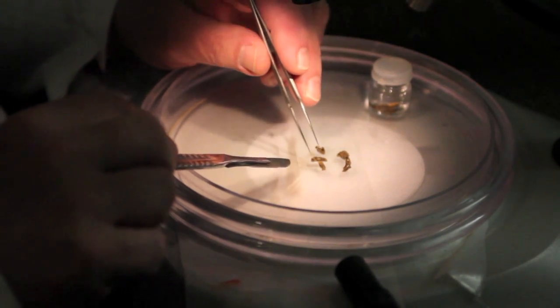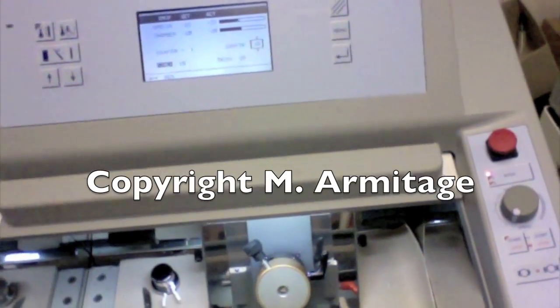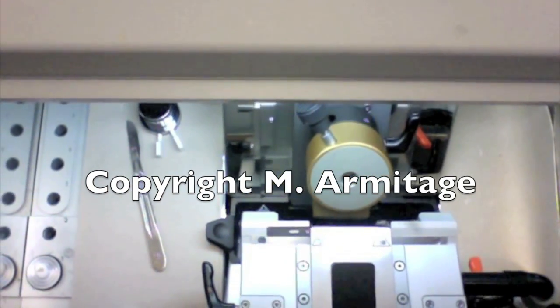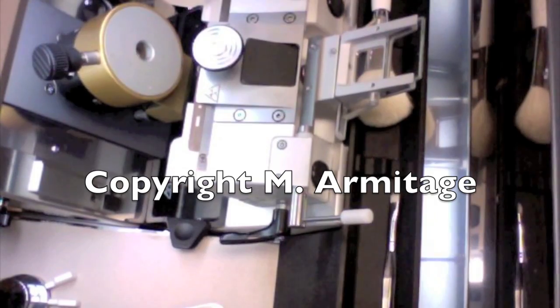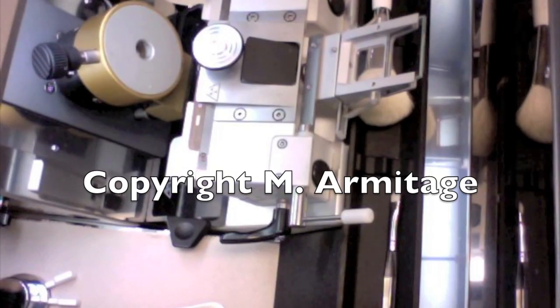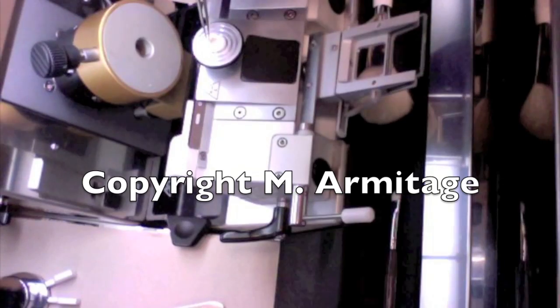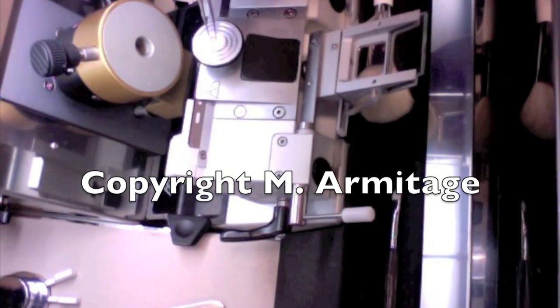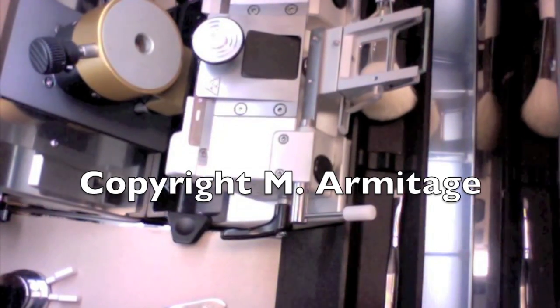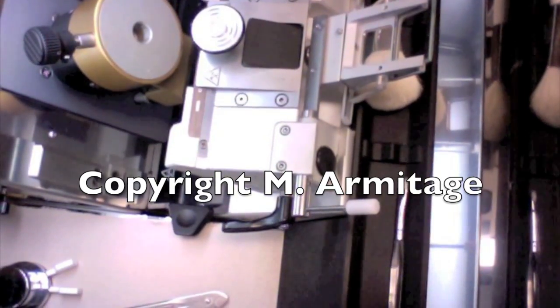I will thin section it, put it on a slide, and you will see the actual osteocytes. This machine is a cryostat, or frozen section machine, that allows us to freeze our tissues inside this chamber. Once frozen, we can thin section them to a very thin slice — about 10 microns in thickness, which is about one-tenth the diameter of a human hair. The silver specimen holder is at the center of the field of view, and I'm placing specimens on it — thin films of tissue from the bones we recovered in the iDino project.